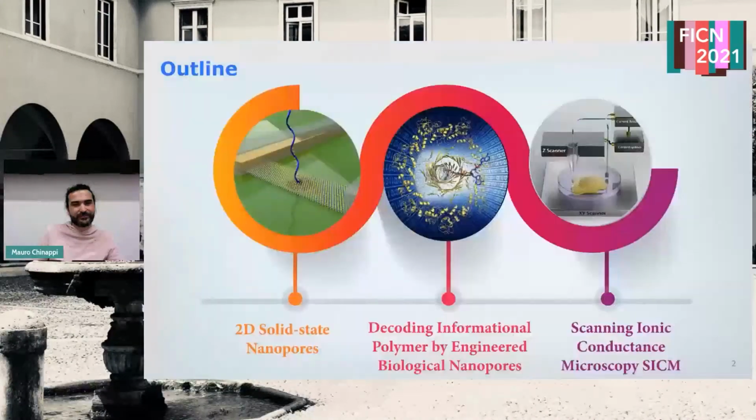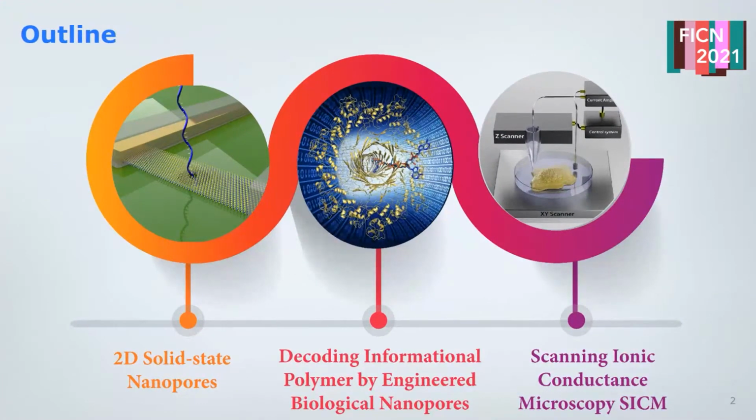So for today, I would like to walk you through three topics, going from solid-state nanopores. These are three recent stories from the lab where we use solid-state nanopores, biological pores, and also incorporation of scanning ion conductance microscopy with fluorescent microscopy.